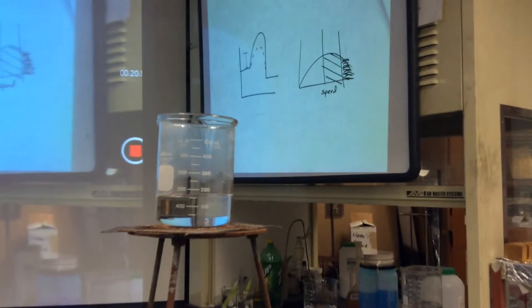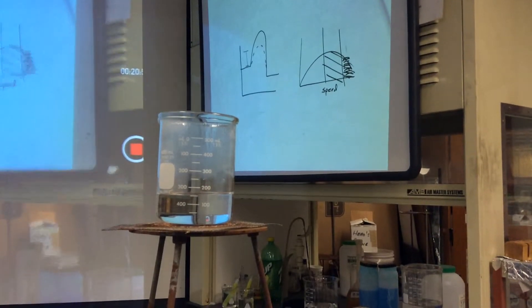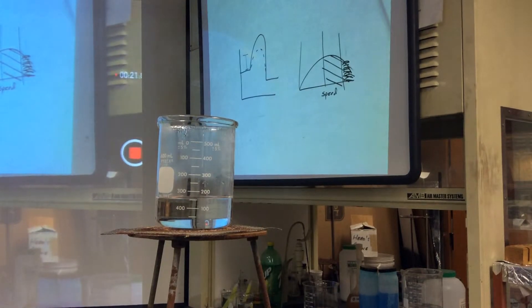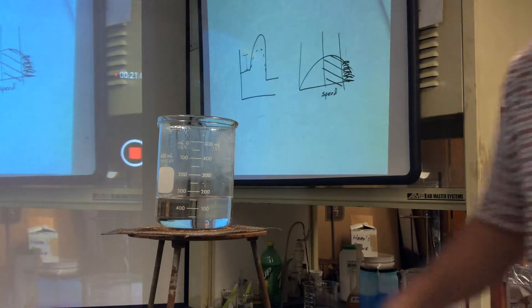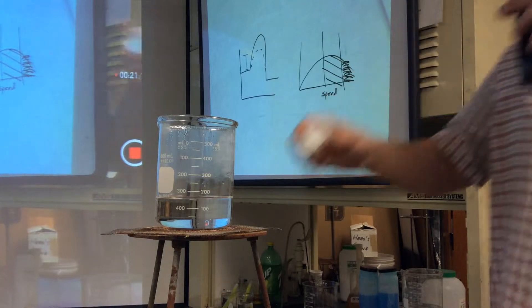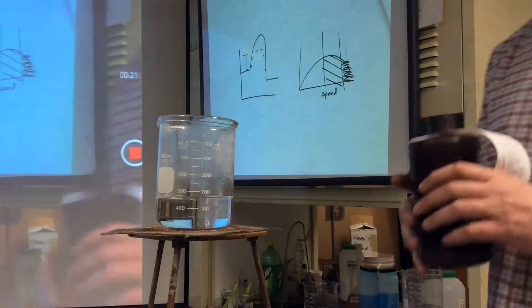This is Rochelle salt. It's going to make a complex and it's not really important to know what the reaction is, but to see what's happening and to observe. So what I'm going to start with is some hydrogen peroxide.